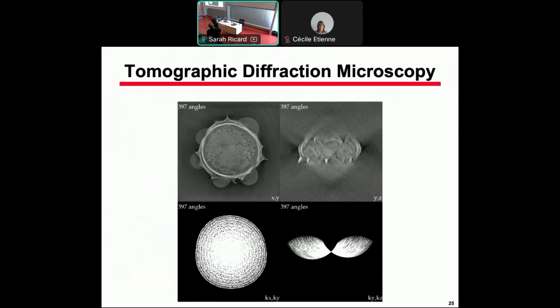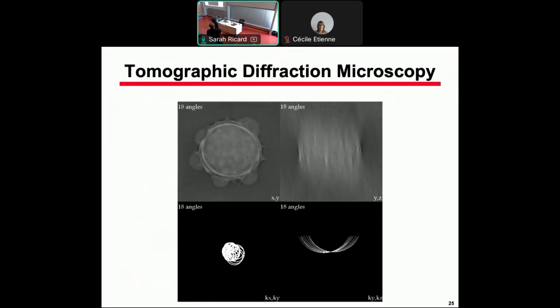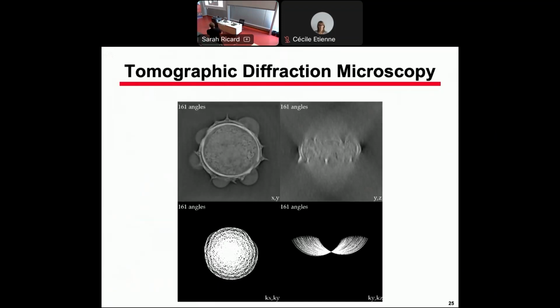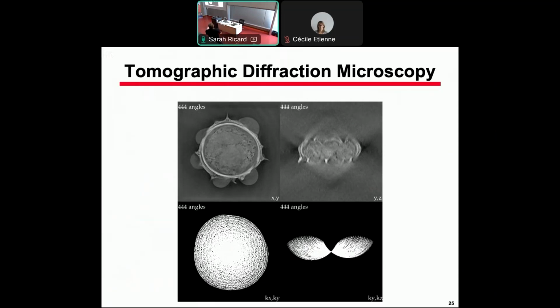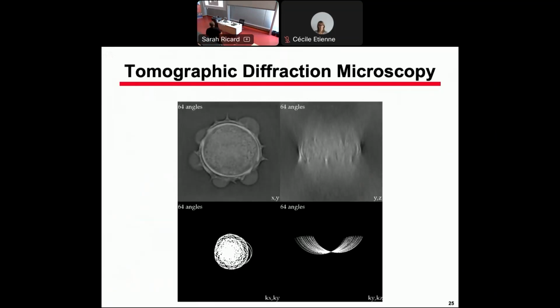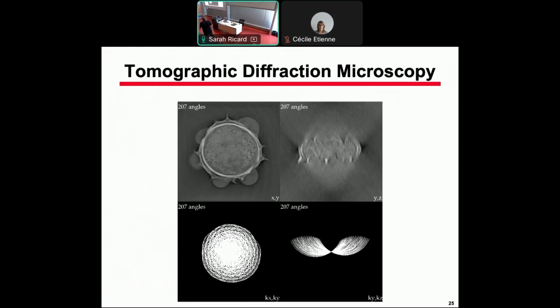And you see here the quality of the images improves a lot, of course, but the most spectacular is here. We start from fringes. At the end, we can distinguish the object. It's far from being perfect. The quality is still lower along the optical axis because of the simplicity.